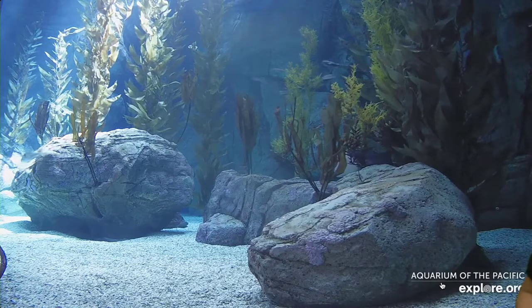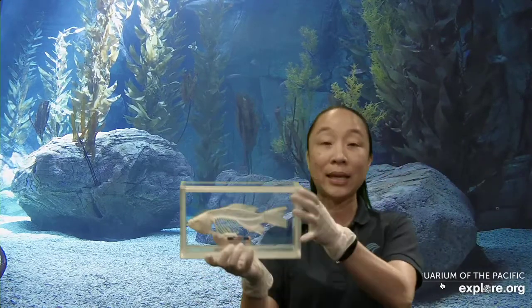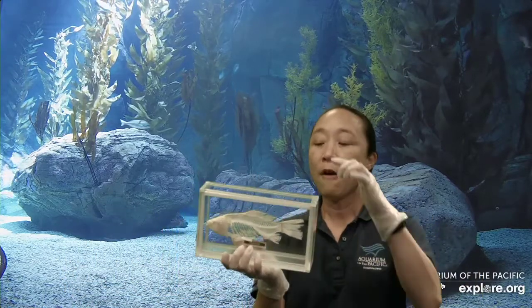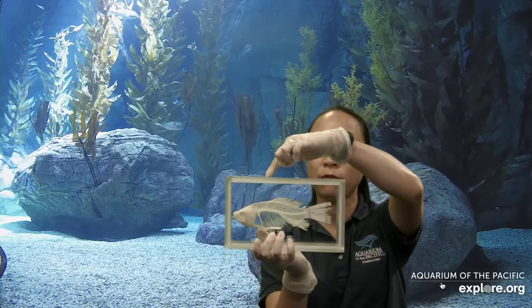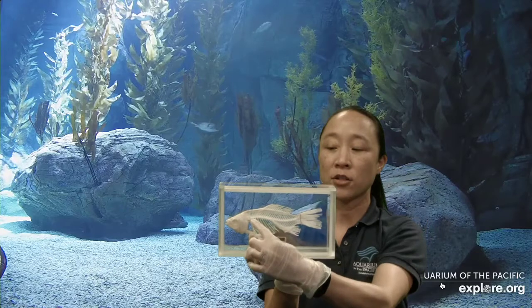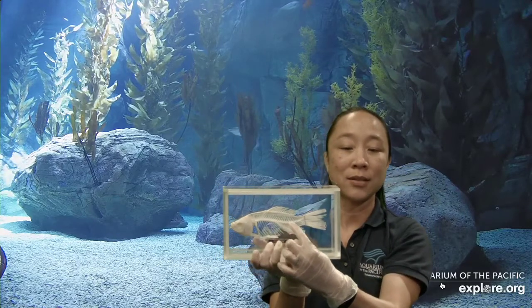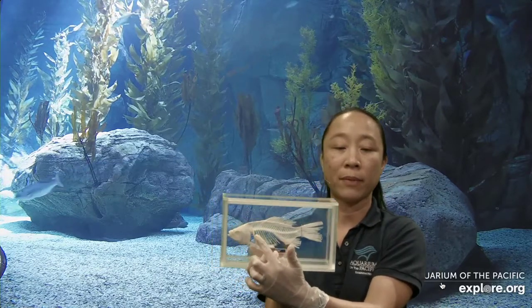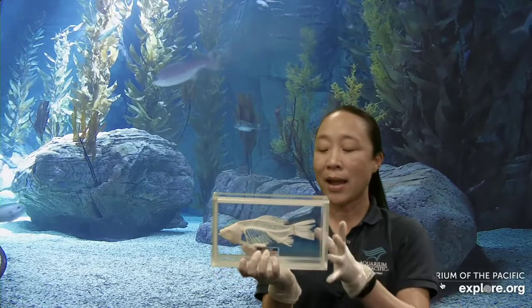For those who have never seen the inside of a fish before, we're going to cut into it in a minute. But here I have a skeleton of a fish and you can see its backbone. For us, our backbone is just right here down the center — if you bend a little and feel, you can feel the bumps. It's not the thing on the very top ridge; it's this thing in the center. And the things you see coming from the backbone around here — those are the ribs, just like us.